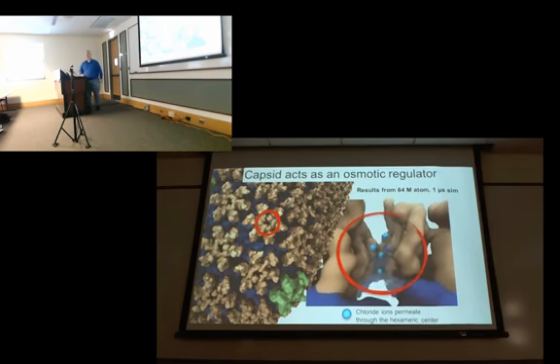If I rendered that with OpenGL, you wouldn't be able to tell that there's a hole unless you had it exactly lined up. It's one of those nice examples in the movie.